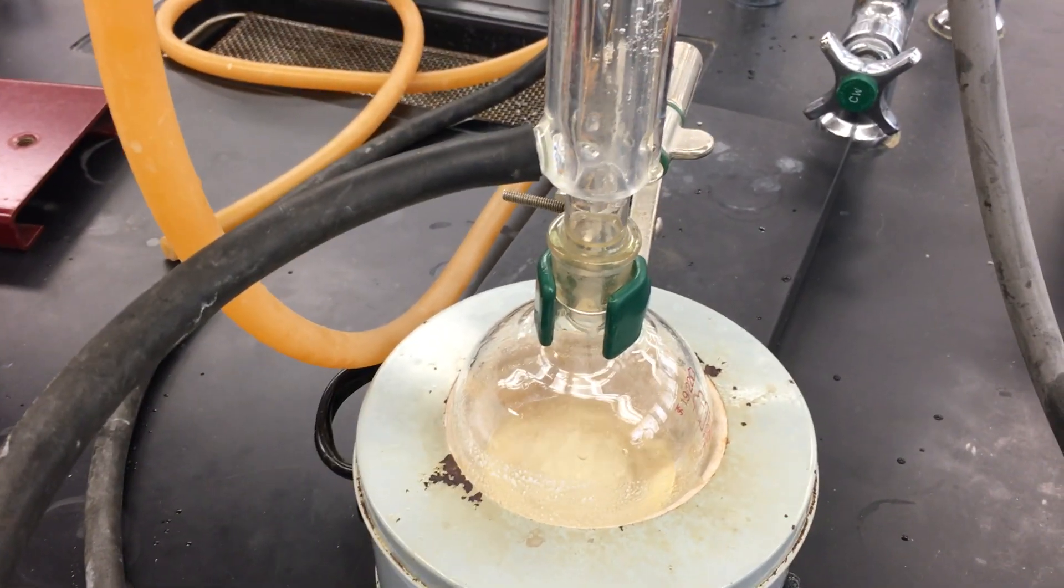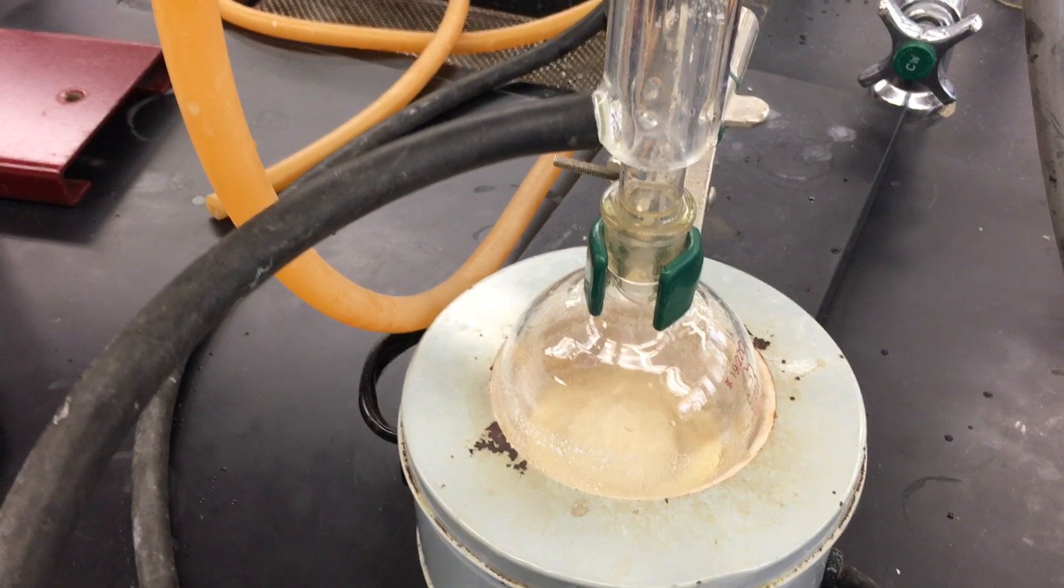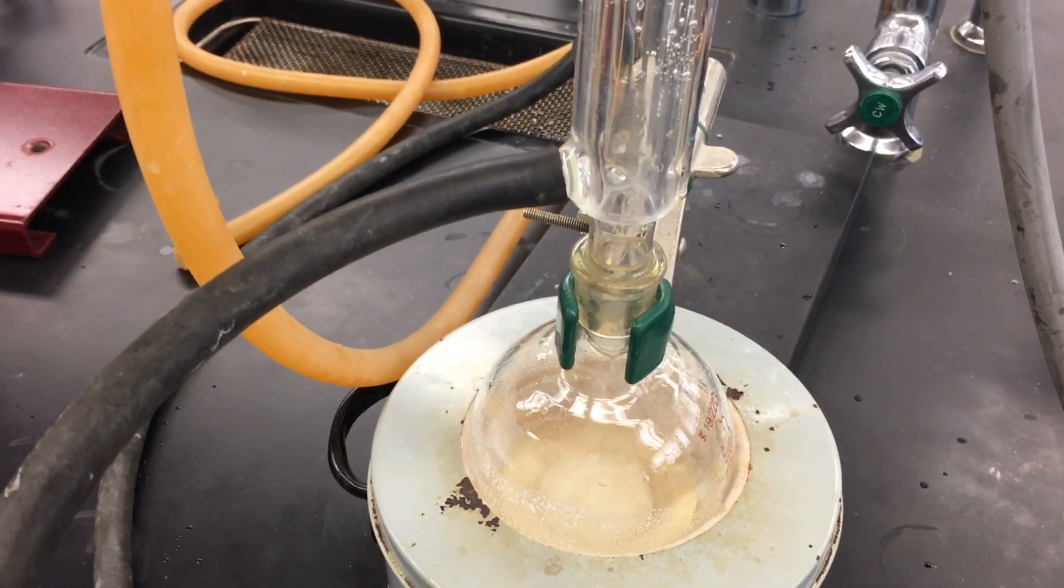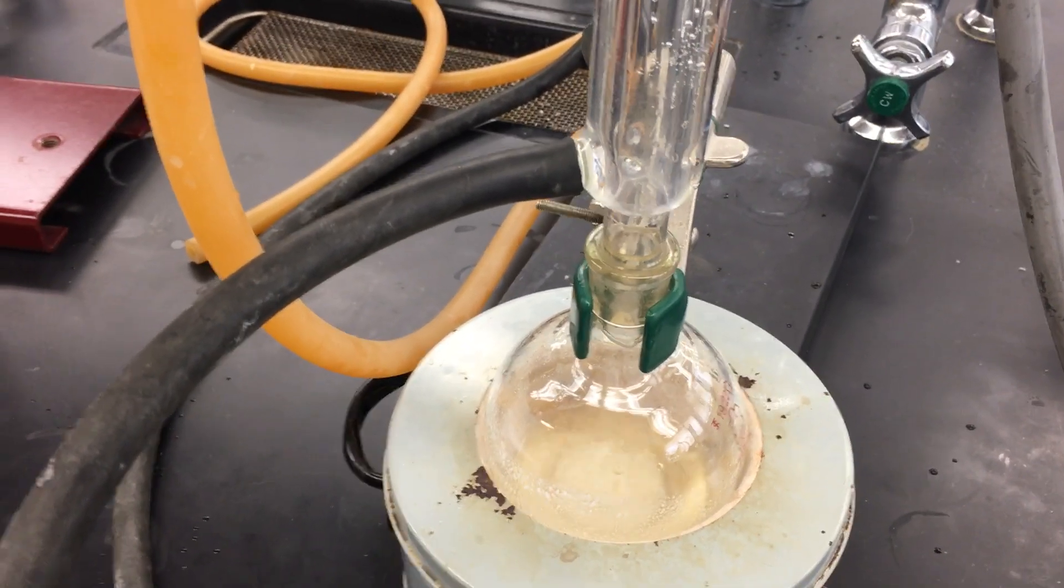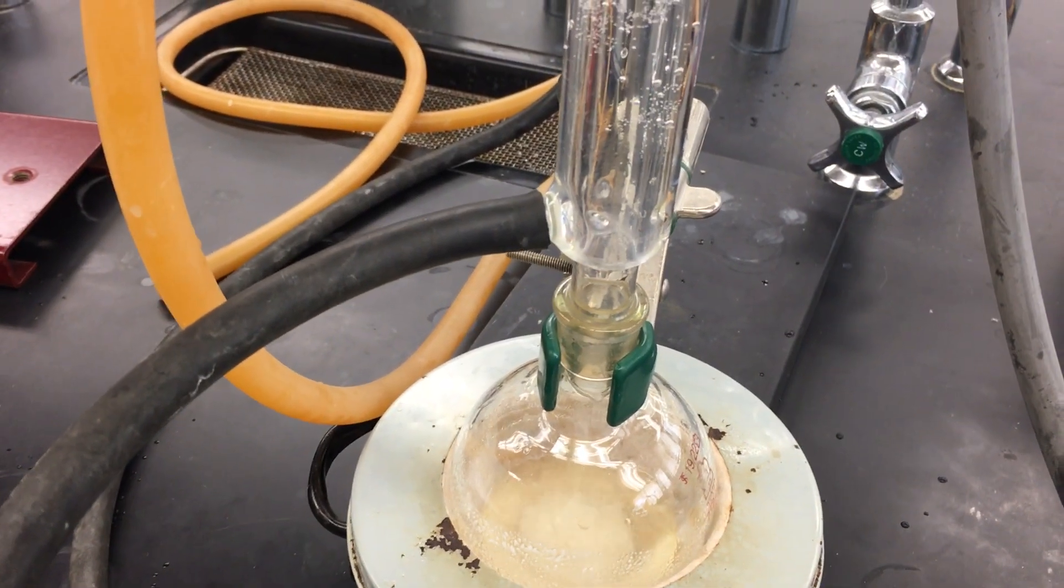What's happening is that the hydrogen bromide generated by the reaction of sulfuric acid and sodium bromide serves as the nucleophile. The bromide ion actually serves as the nucleophile.